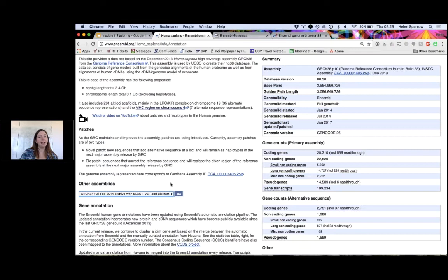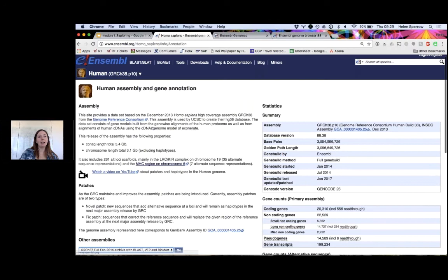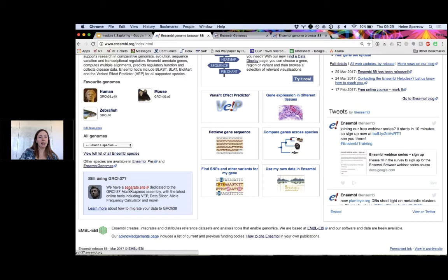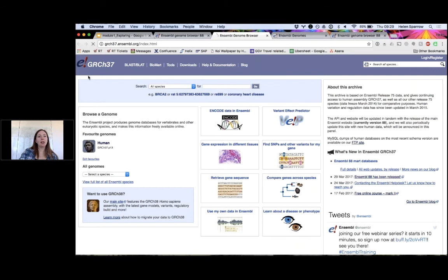One way to access GRCh37 is to click the link from the species page. Alternatively, going back to the Ensembl homepage by clicking the logo, you can also access the human GRCh37 archive site directly. This GRCh37 archive site works the same way as GRCh38, but if you are specifically working on this assembly, please come to this site and make sure you're using tools from this site.